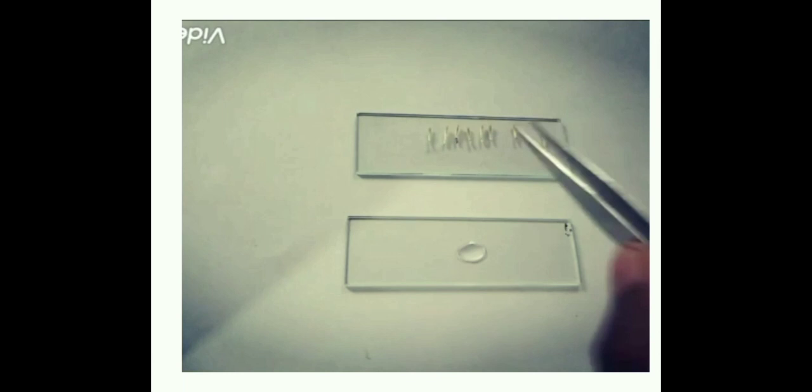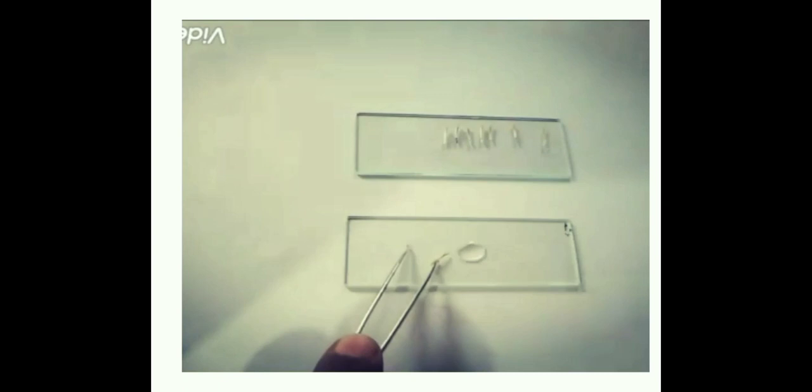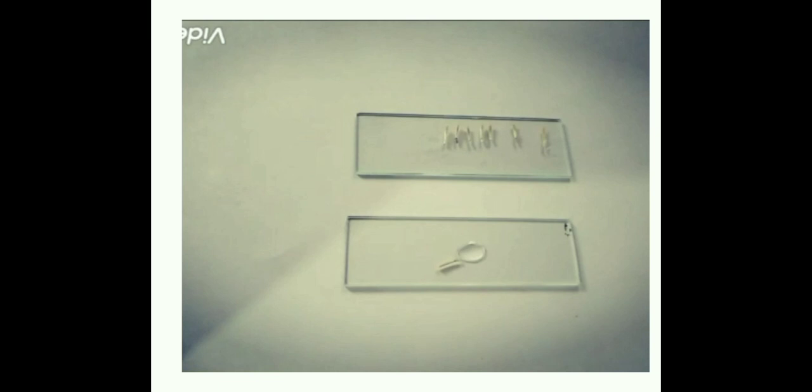Take another clean glass slide. Put a drop of water in the center. Take one floret and dissect the ovary wall with the help of needles. You can gently press, squeeze, or cut the ovary wall with the sharp edge of the needle.